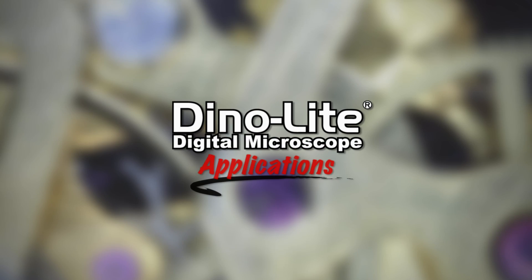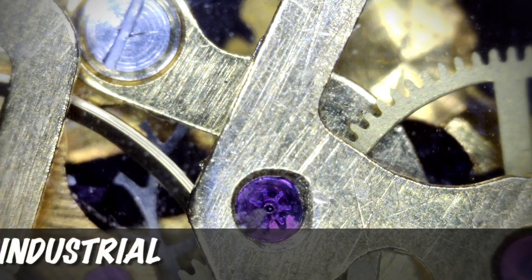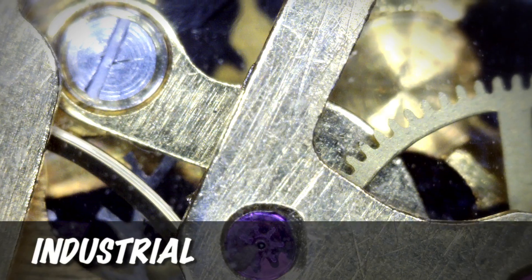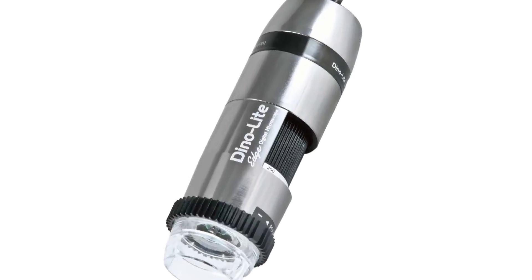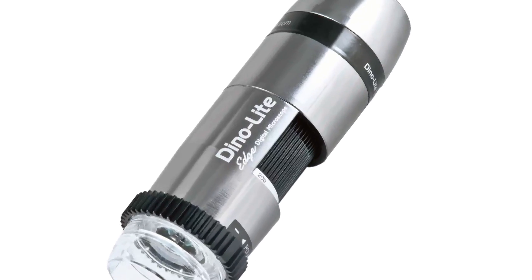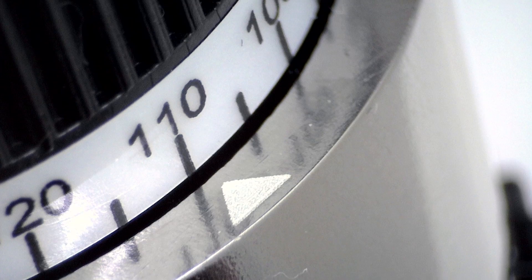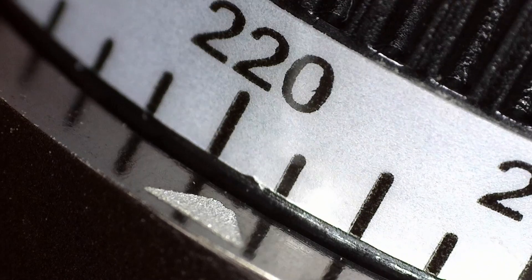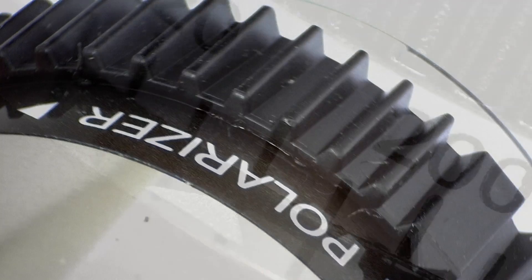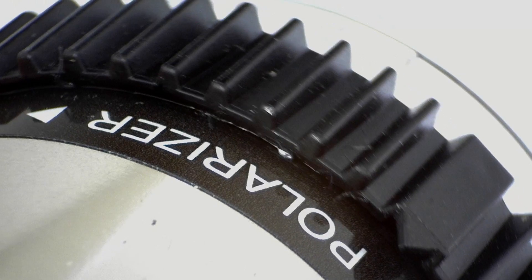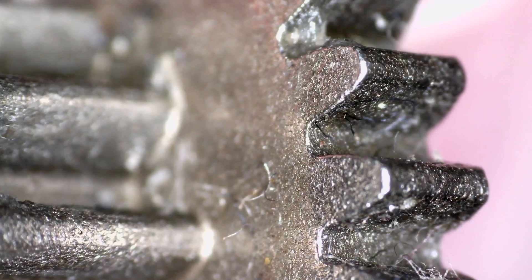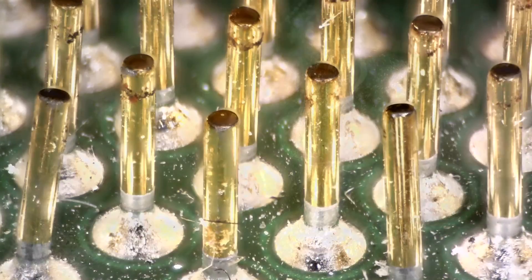This is a video about industrial applications for Dynolite digital microscope cameras. These models are connected to a computer via USB and include easy to use software that allows users to capture images and video as well as many other basic and advanced features.